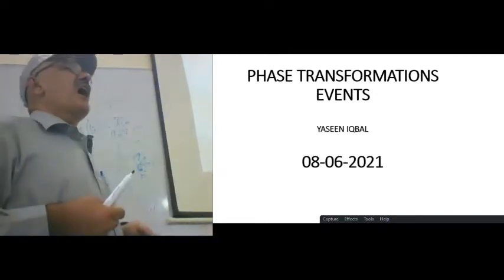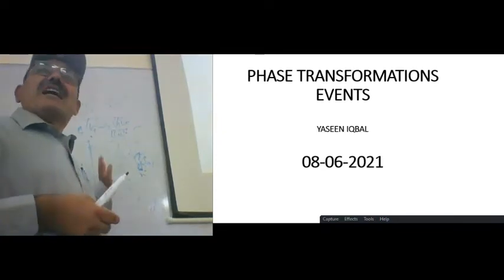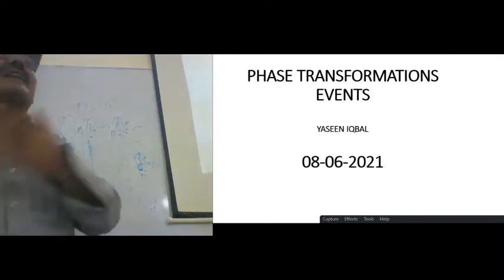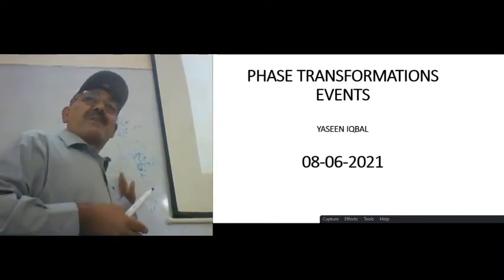But how can I confirm that this heat treatment at this temperature either forms the phase or not? For that I go to XRD, X-ray diffraction.